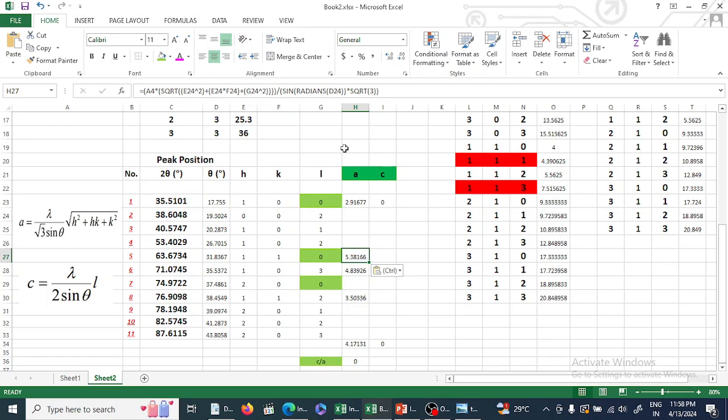You can see there are a lot of videos where you can find how to find out the value, but they are not talking about the hexagonal structure, because it's too much hectic. But if you want the exact thing, then you have to do this thing, bro. You have to work. Sorry, what I'm doing, I have to change these values.